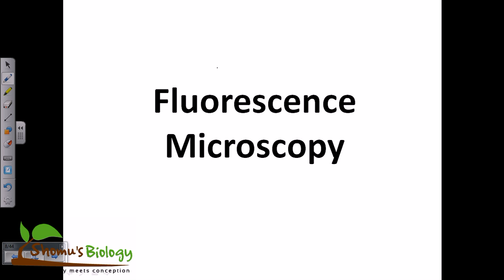We have talked about other types of microscopy, such as bright field microscopy, which is simple light microscopy. Fluorescence microscopy is also a part of light microscopy, but it is more advanced, and its use in biological systems is even greater nowadays, because it gives us a proper understanding of the different regions inside the cell, right?